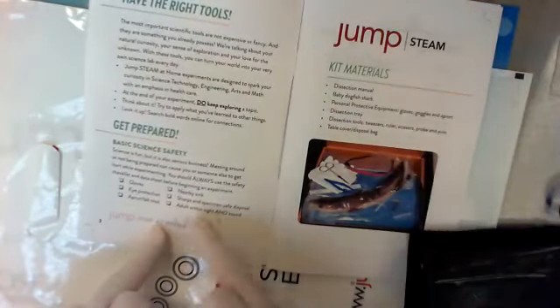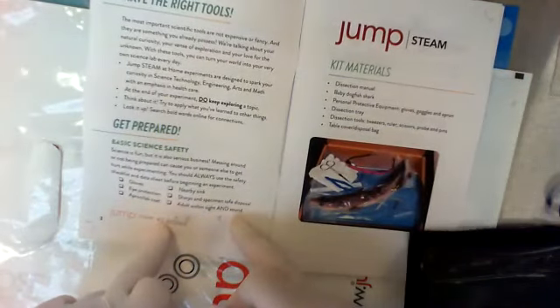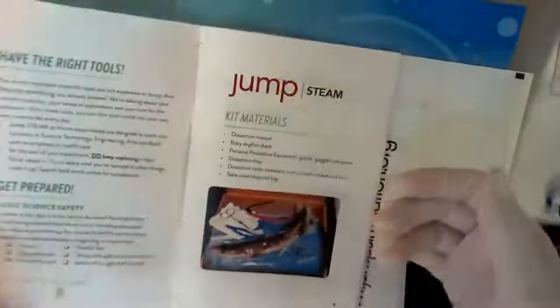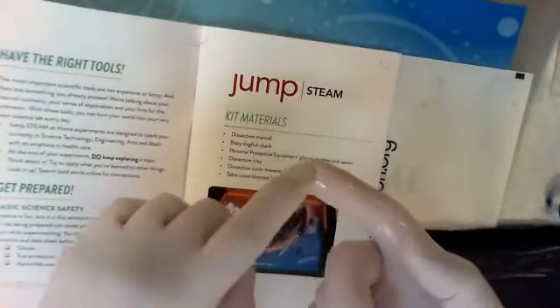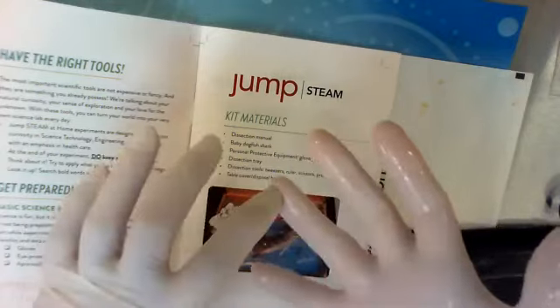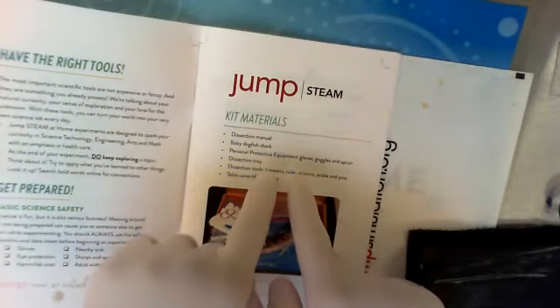And then I also said adult within sight and sound. So not just where you can yell for them, but make sure they're there. Because if you yell and they're not there, that's not good. Never good. All right. So you have your apron on. You have your gloves on. You have your goggles on. Those are your 3 pieces of personal protective equipment. Make sure they're on.